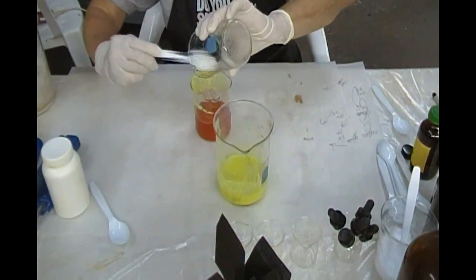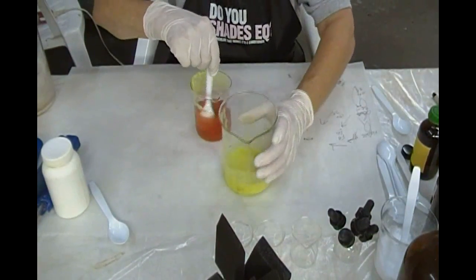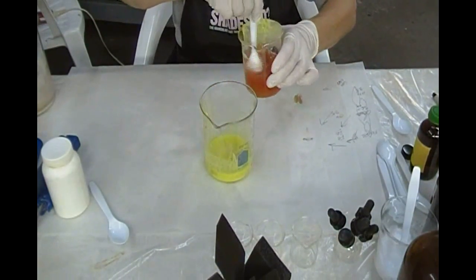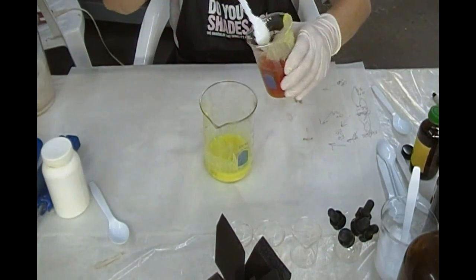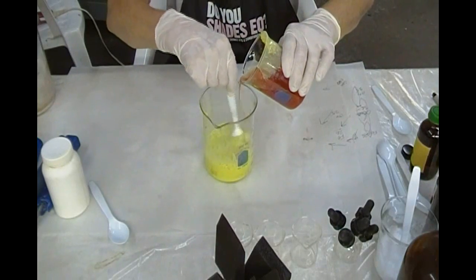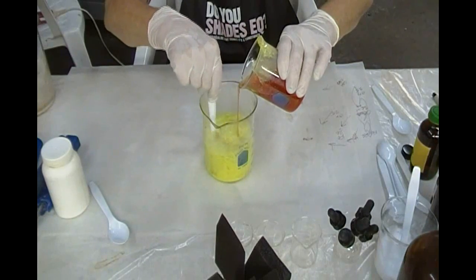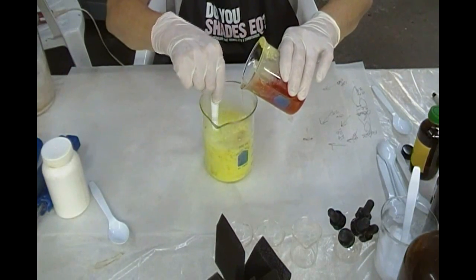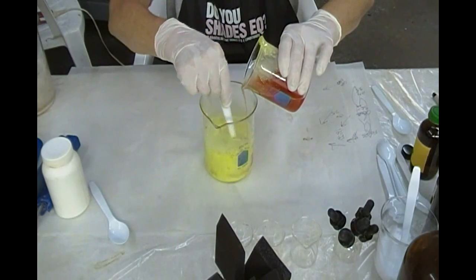Now you can add the alkali. This is sort of like baking soda and vinegar. Slowly, with stirring, pour it in. Oxalic acid is poisonous — any of the oxalates. You can see the vinegar reaction going on. If you dump that in all at once, we would have an overflow on the table.